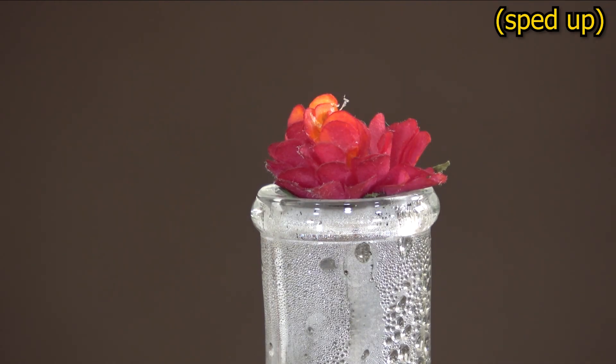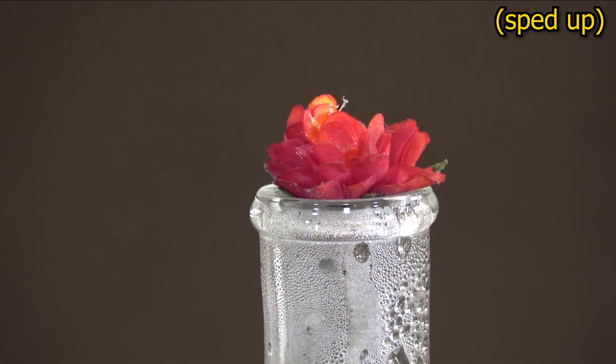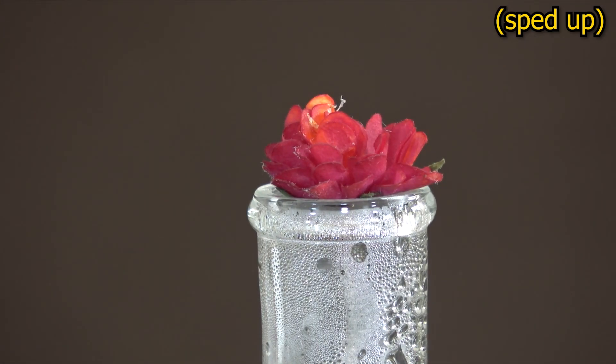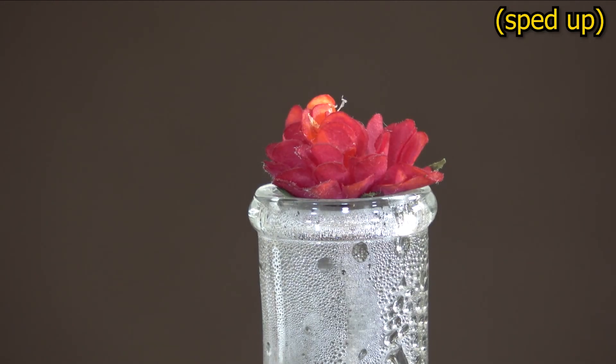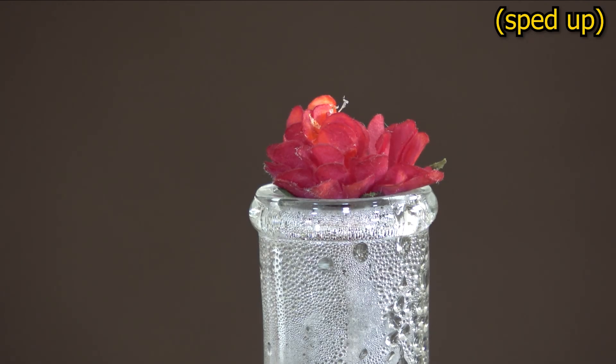But how did it manage to trick the pH indicator into showing the presence of an acid? As a matter of fact, there was no trick. Sulfur dioxide gas, like many other gases, can dissolve in water. It doesn't stay there as sulfur dioxide molecules — it turns into sulfurous acid, and the latter makes the thymol blue turn red. This process can also be reversed: if the supply of fresh sulfur dioxide from the flask is halted, more and more sulfurous acid will turn back into water and sulfur dioxide, making the flower less acidic.